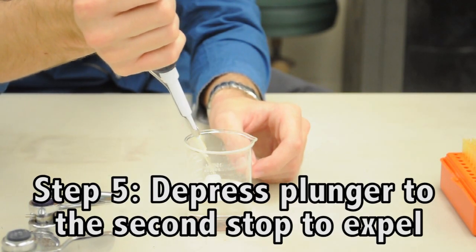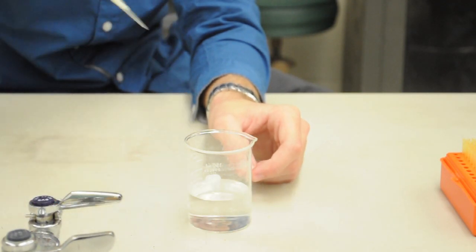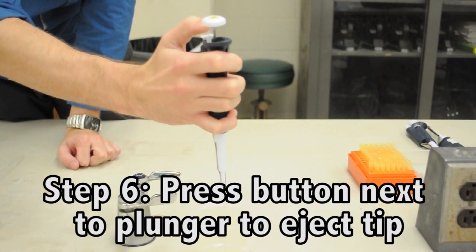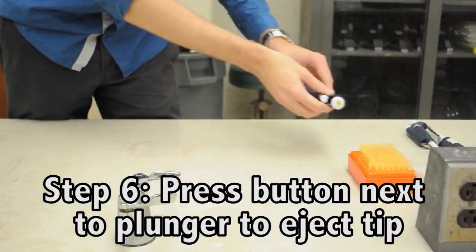You'll then depress the plunger to the second stop in order to expel everything. When you're finished, press the button next to the plunger to eject your tip.